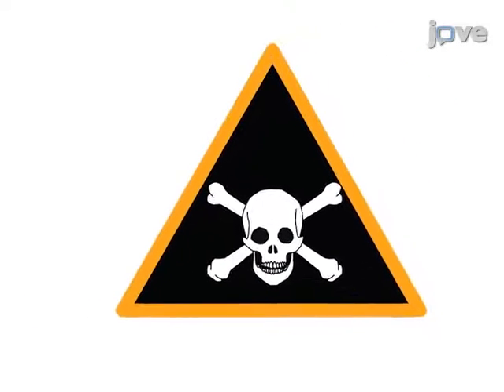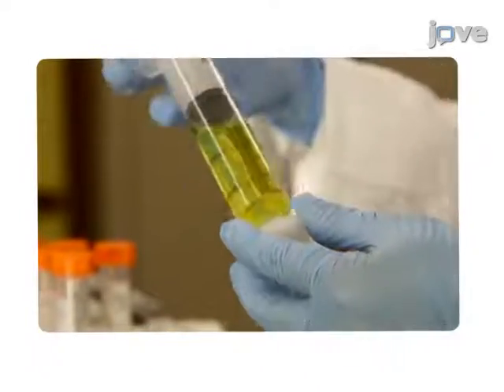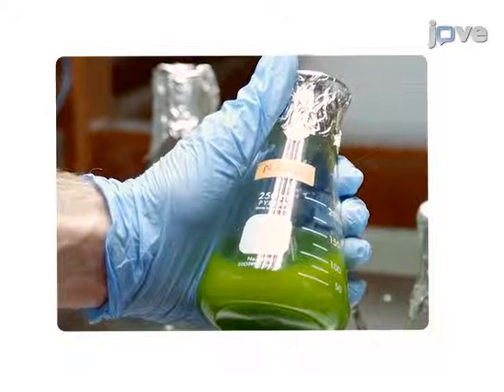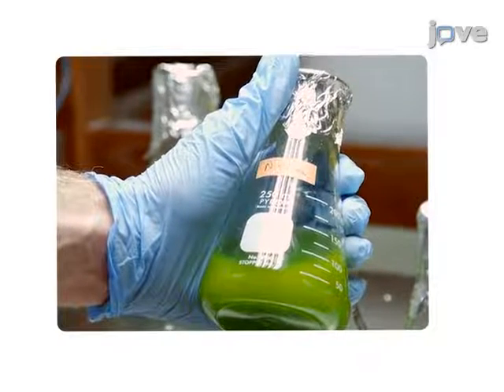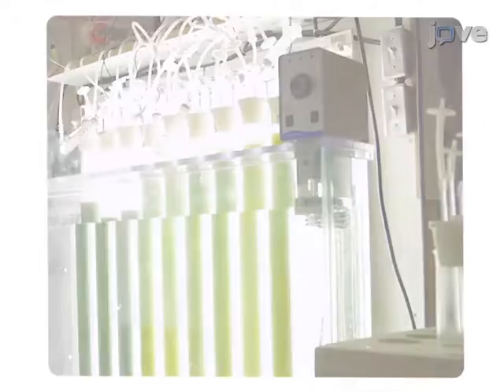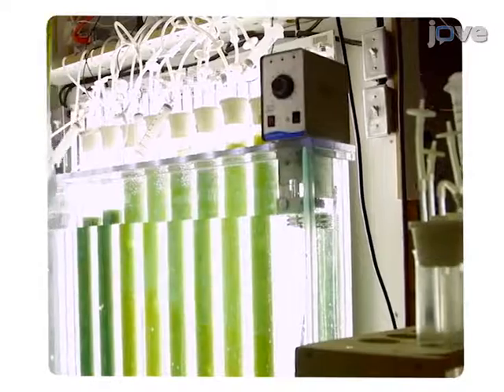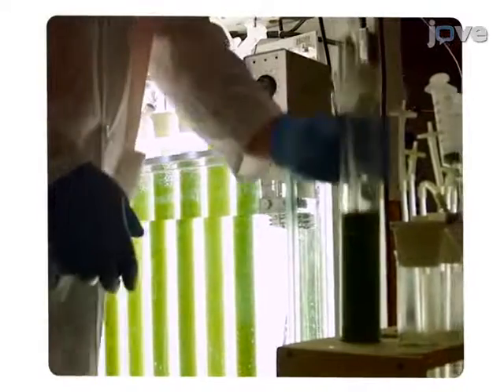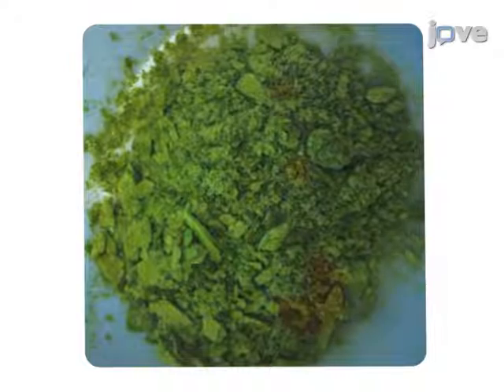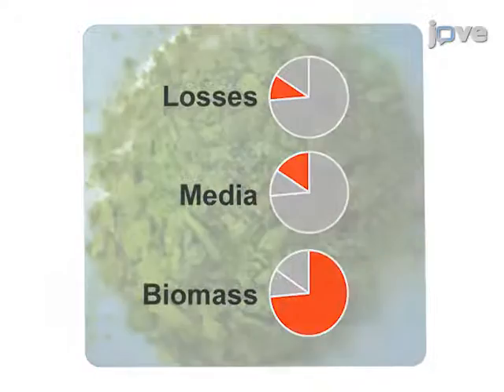These levels are used as baseline contamination and stocks are made. Next, the required inoculum is cultivated and the large-scale growth platform is set up. Then, the system is inoculated and samples are periodically taken for processing. Finally, the biomass is isolated and the end fate of the contaminants is quantified.